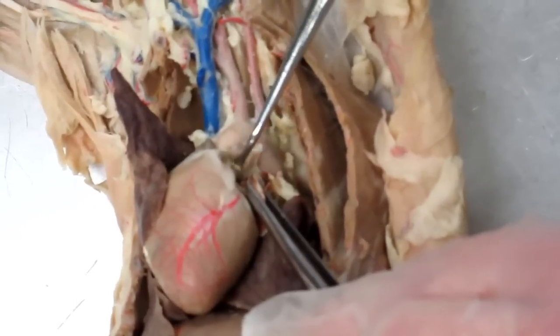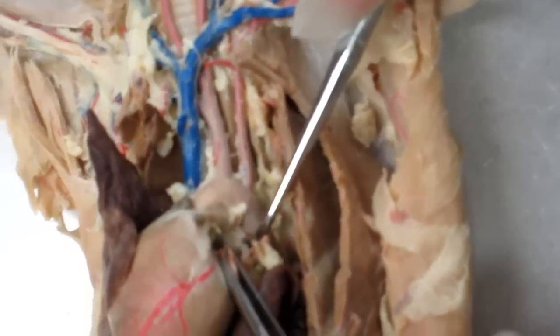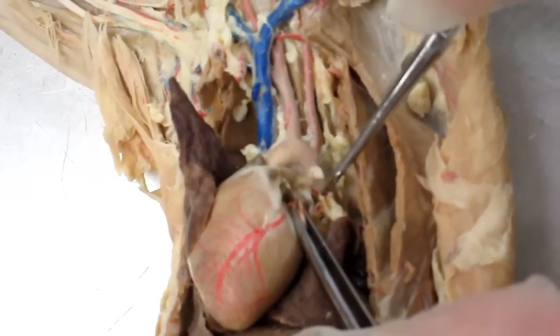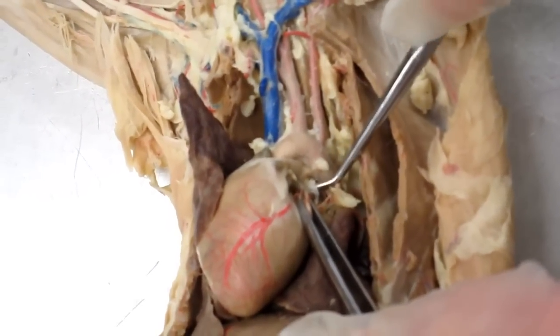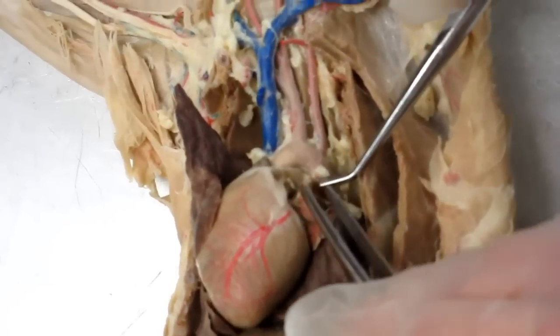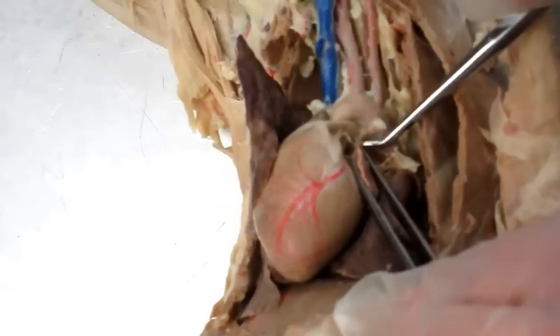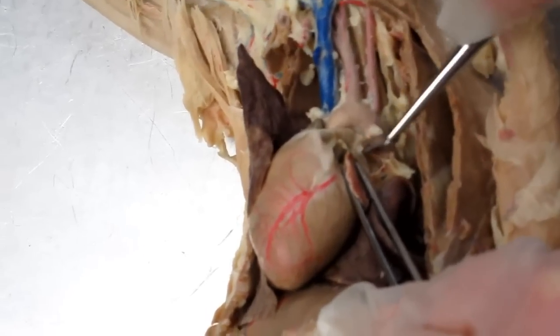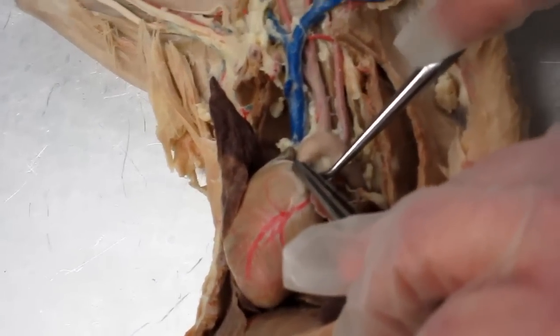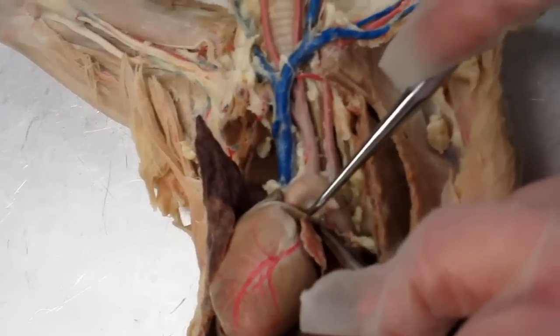Okay, the pulmonary artery would be coming off of the pulmonary trunk. There'll be another one heading over this way, which we really can't see too well. And that would be this here. It's actually damaged on this specimen because of my aggressive dissection. Okay, but that would be it right here. And then if we move that out of the way, we can see the aorta.